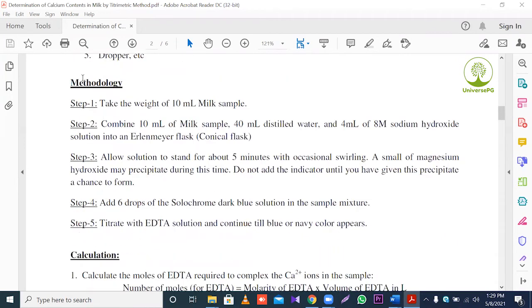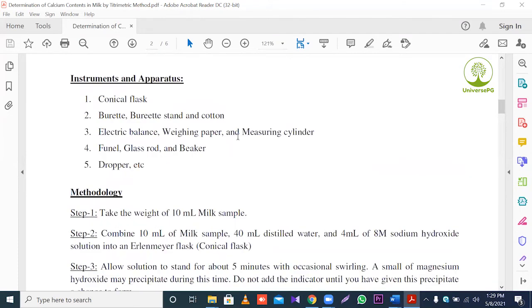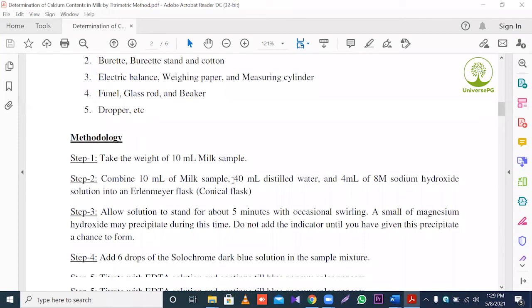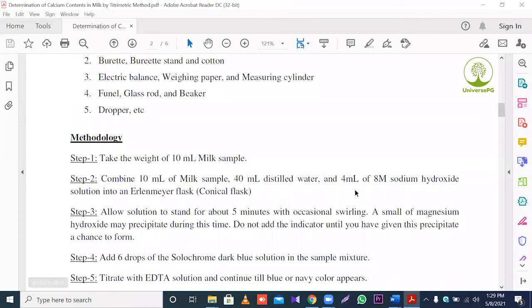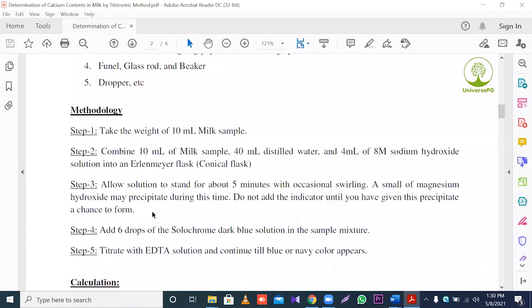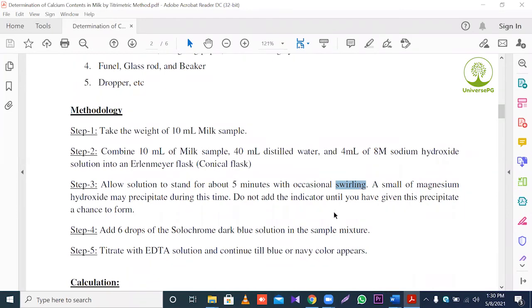Next, the methodology of the experiment. Step one: take a 10 ml milk sample in a conical flask. Step two: combine the 10 ml milk sample with 40 ml distilled water and 4 ml of 8 molar sodium hydroxide solution in a conical flask. Step three: allow the solution to stand for about five minutes with occasional swirling — that is, shaking — to properly mix the solution. A small amount of magnesium hydroxide may precipitate during this time.